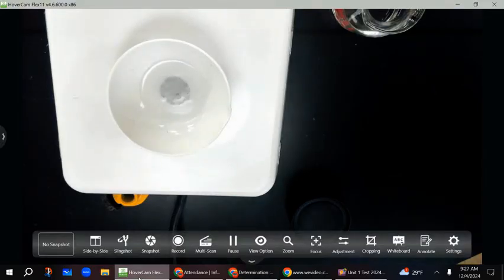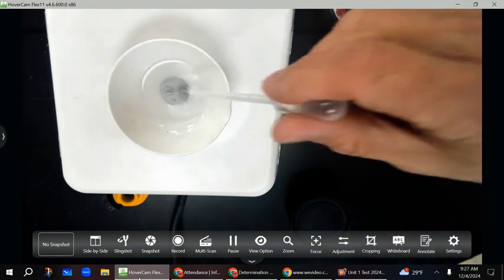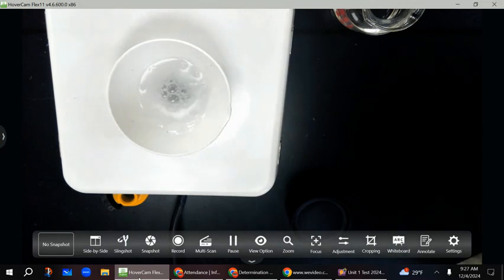Again, I still have all kinds of zinc in the bottom. Yes, it is still reacting, but there's still a long way to go. So I'm going to add another dropper full of acid, keep that process moving along, making my observations, getting ready to go. Now, when I get to the point where there is very little left in here, a few specks here and there, call me over and I'll say yes, go ahead, or no. Then you start to turn the hot plate up and you turn it on. But there has to be very little zinc left in here, okay?